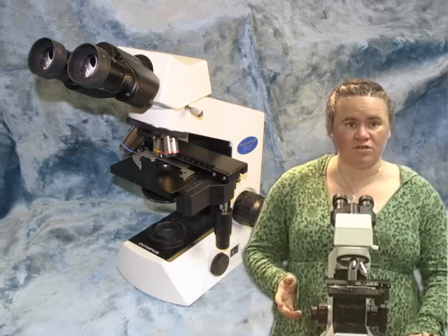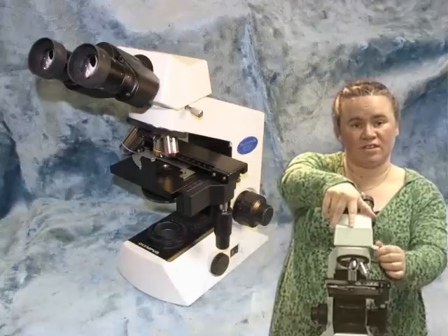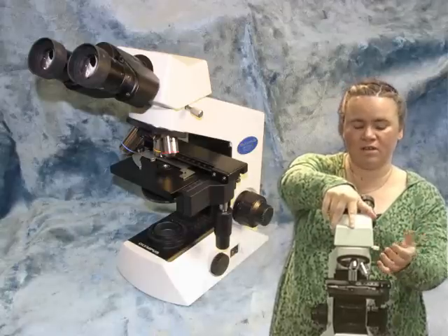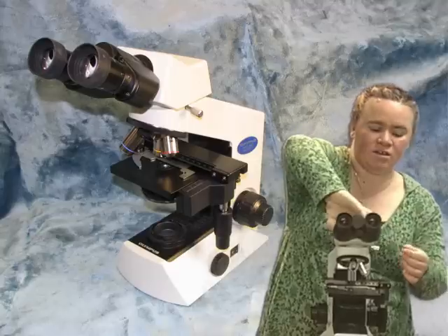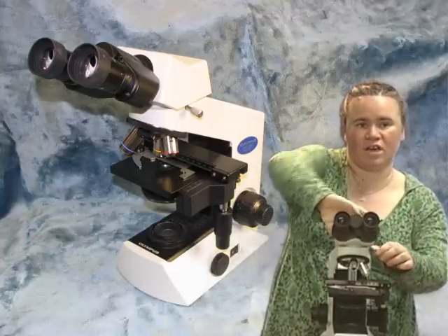Some people prefer to use it with the eyepieces turned around. To do that you unlock the screw on the side — you don't have to unlock it completely — then turn the head so that the eyepieces are rotated 180 degrees, then lock down the screw again.